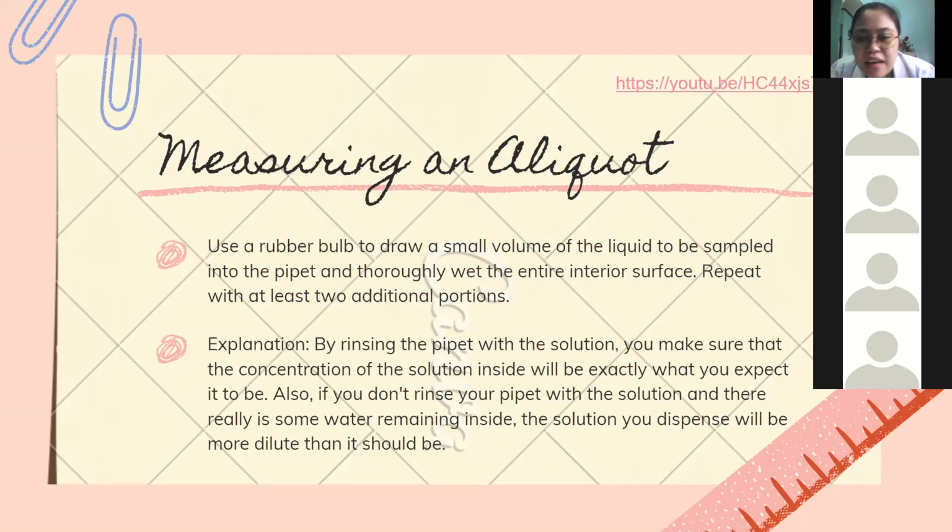Also, kapag hindi mo ito gagawin, if you don't rinse your pipette with a solution, the water inside na nabilin during the cleaning process, the solution you will dispense will be more dilute than it should be. Okay? Kaya katong mga water nga naa sa inside sa pipette will be incorporated to the solution and that will make your concentration lesser compared to the original one.